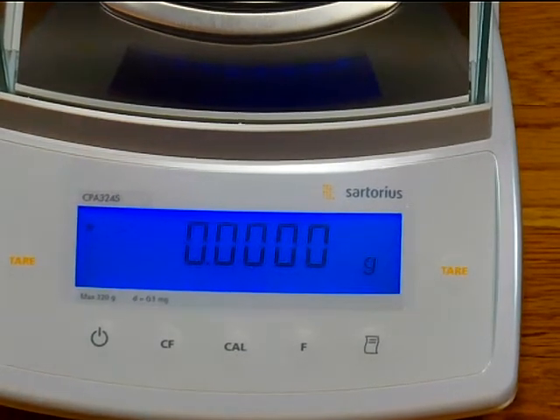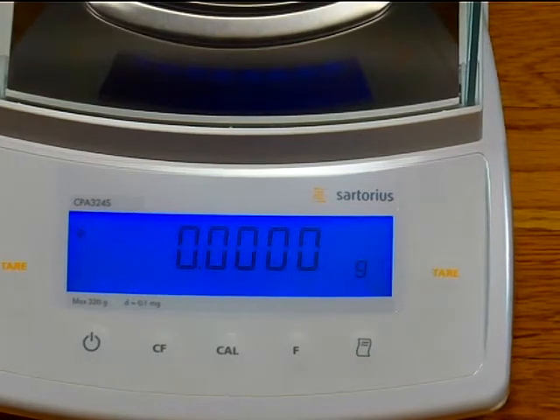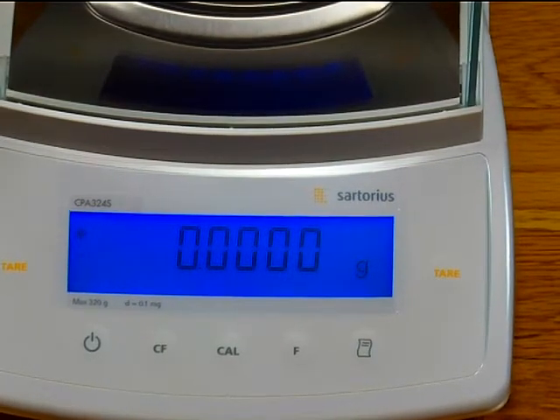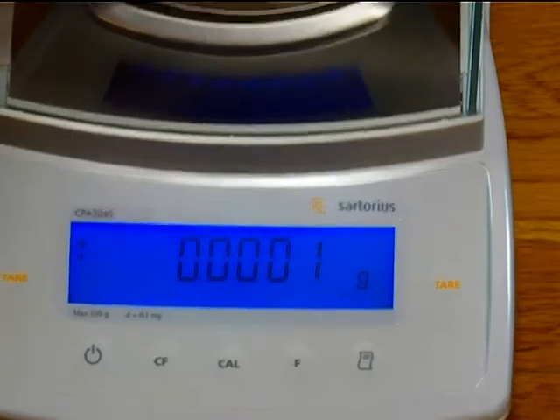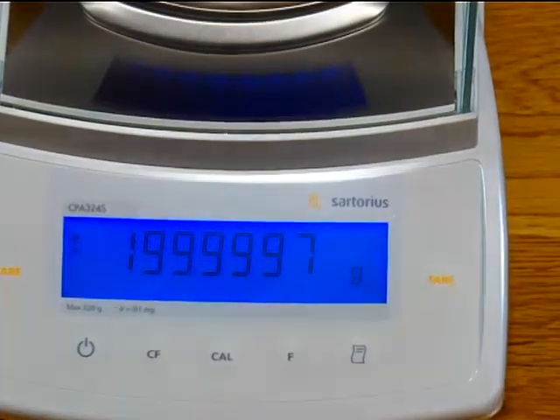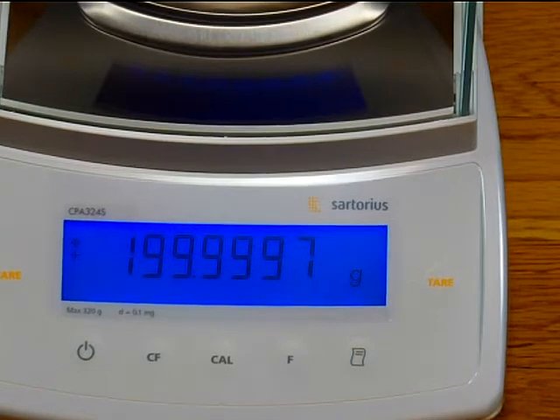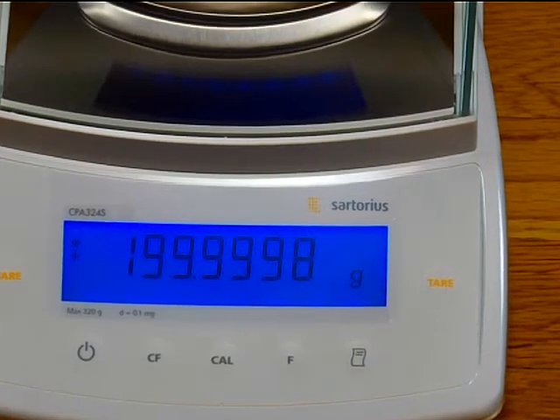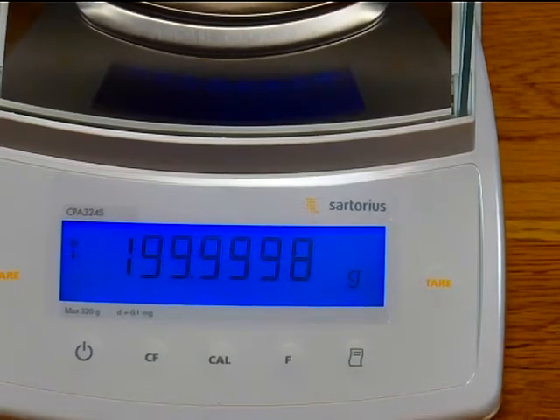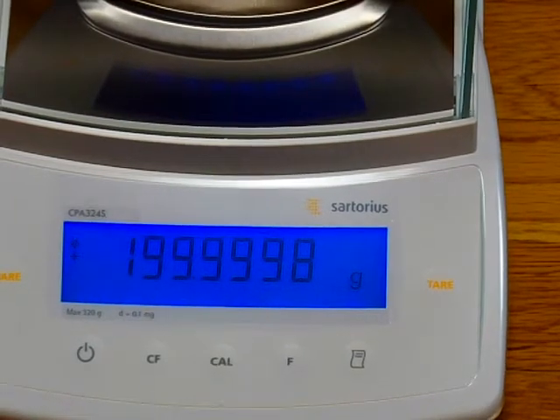Let's put some cal weights on and see how this balance performs. I'll open up the door. I have a 200-gram ASTM Class I weight, and we'll put this on here. The balance reads 199.9998 grams.